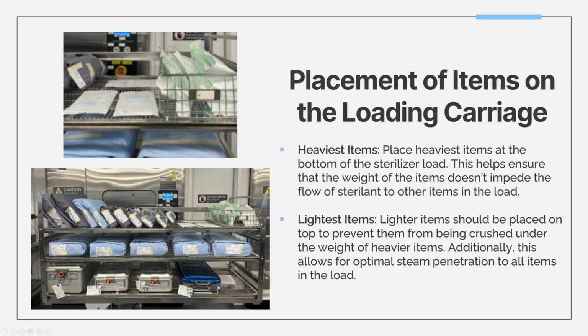So obviously you would not put a rigid container at the top. And we also have to think about it in an ergonomic manner. Especially for a smaller person, it's going to be a challenge to lift a 25-pound tray all the way here. And it's very dangerous to you as a technician. So the safest method would be to put heavy items on the bottom.